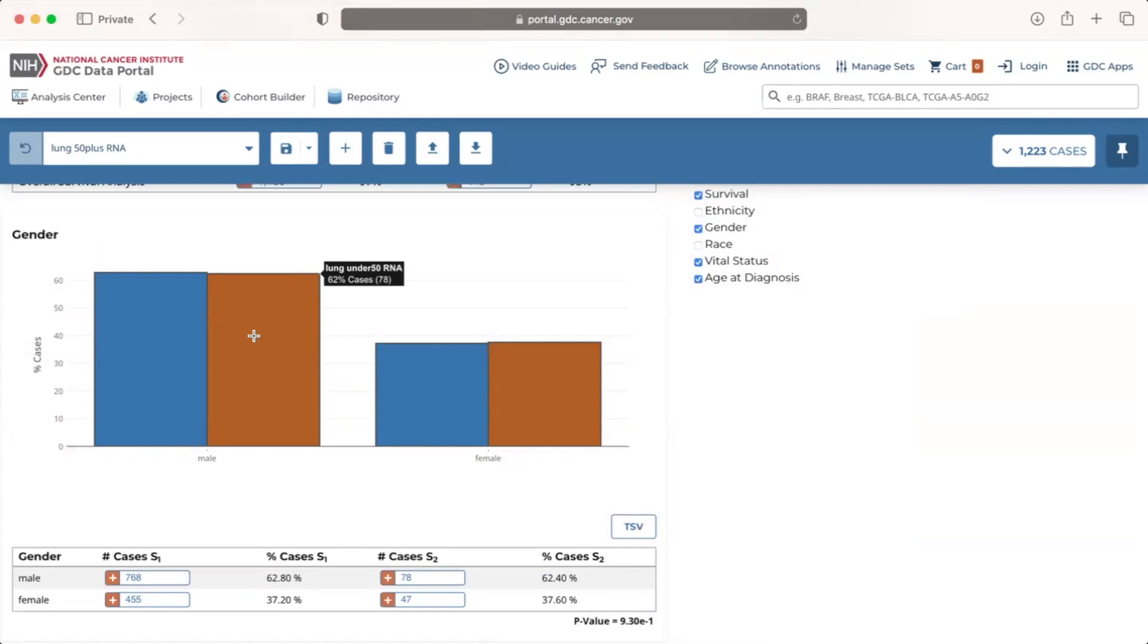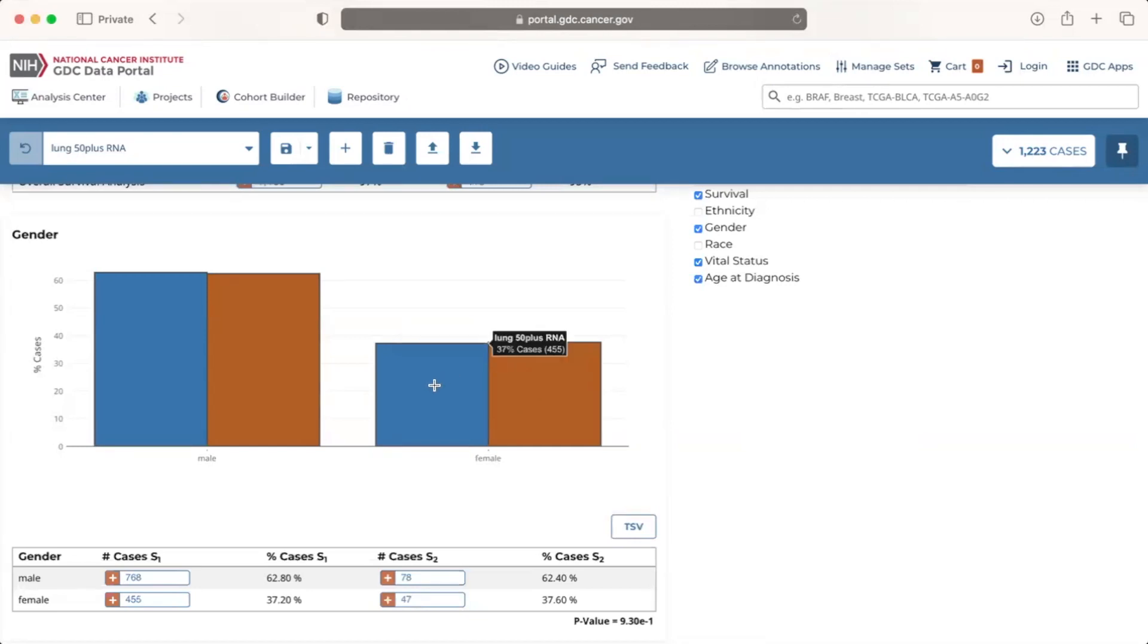Conversely, there is a slightly higher percentage of females among lung cancer cases with RNA-seq data under 50 in orange than 50 and over in blue. We can also hover over each bar to display the cohort as well as the number and percent of cases in each category.